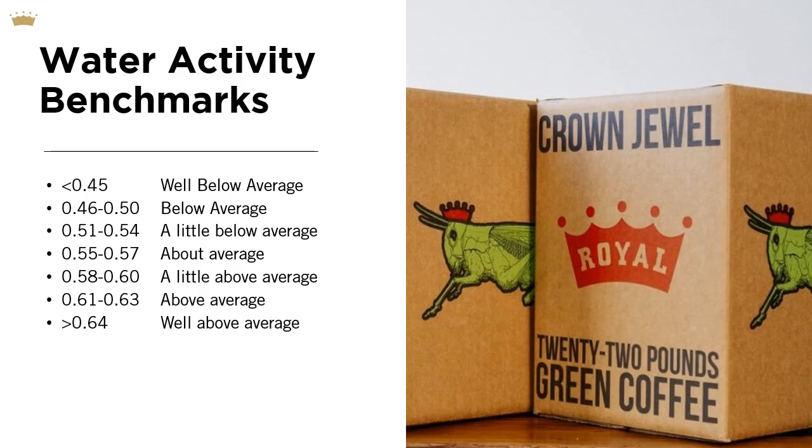And so this bell curve below will show you where I'd consider average and above and below. That 0.55 to 0.57 range is kind of like the sweet spot in the heart of a coffee's average landed. This would be like arrival at a lab for a roaster or an importer, perhaps. And I would consider that range to be not only shelf stable, but also safe for consumption.